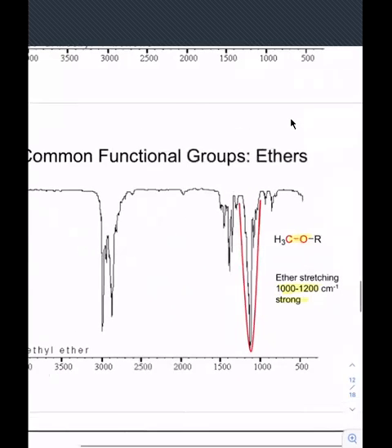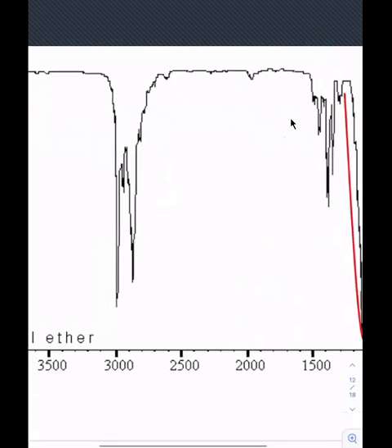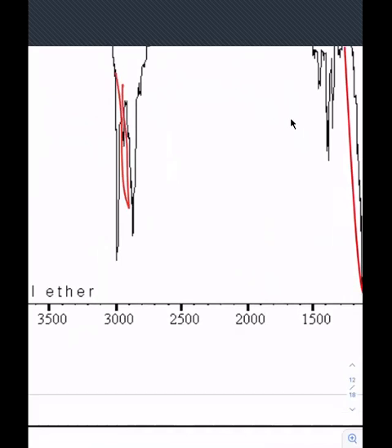So let me see if you are paying attention. Does it take a lot of energy for that to match the vibration of that CO bond based on where it is on the spectrum? Is that a high energy or low energy stretch? Low. It's a low energy stretch because it's closer to 400. The further away you get from 400, the more energy it takes to get those bonds to vibrate and match. And then right here again, you see this jagged, raggedy looking stretch right here.